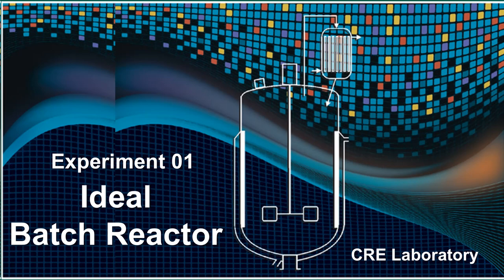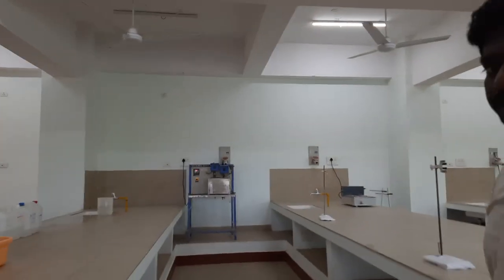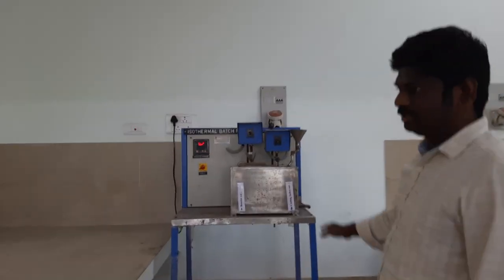In this chemical reaction engineering laboratory, today we are going to discuss experiment number 1, reaction kinetic studies in a batch reactor. So in this, saponification of ethyl acetate in a batch reactor will be discussed. So we are going to perform this experiment in an isothermal reactor.